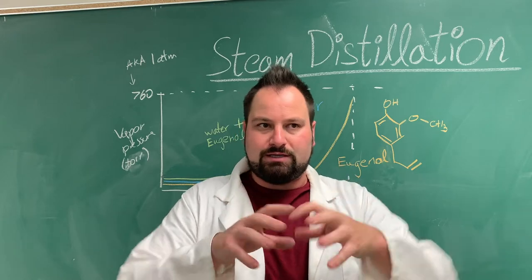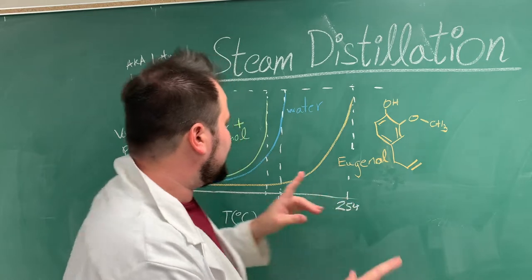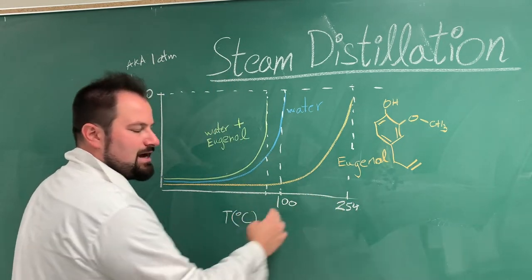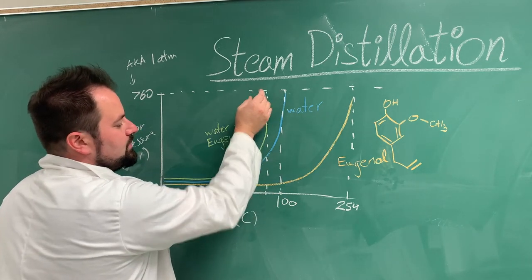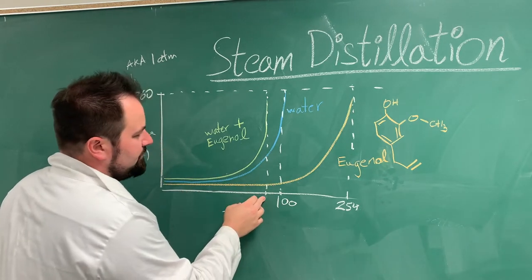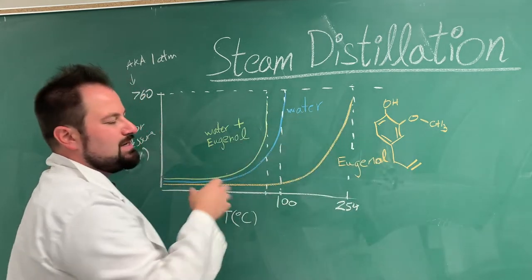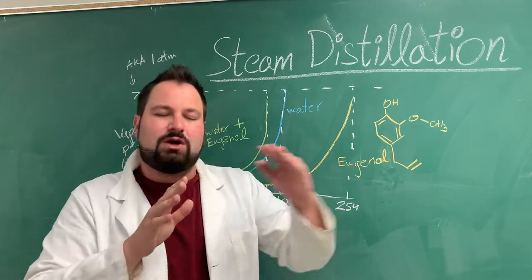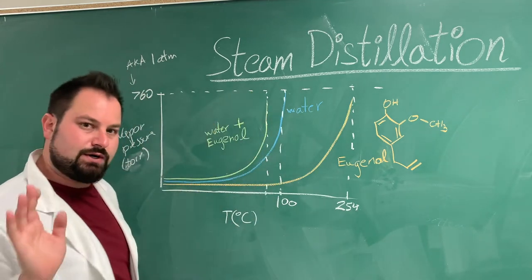Then what matters is the total pressure of a whole solution, which means that the combination of the two will actually boil below either of them separately, because right here you get the vapor pressure at the mid to late 90s temperature for the water, and that of eugenol. That means you get a little bit from the eugenol, a lot from the water, that adds up to 760, and it boils earlier.